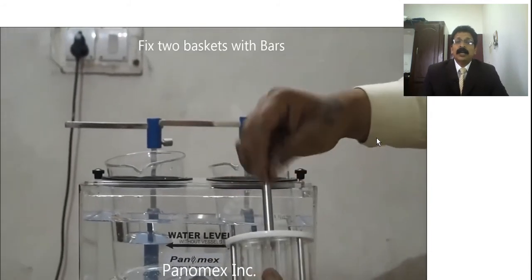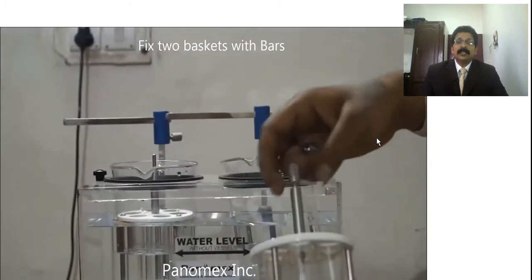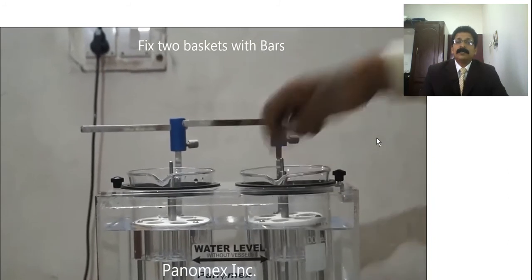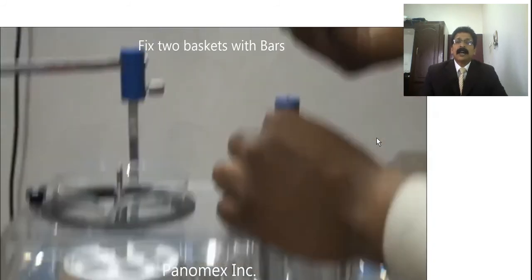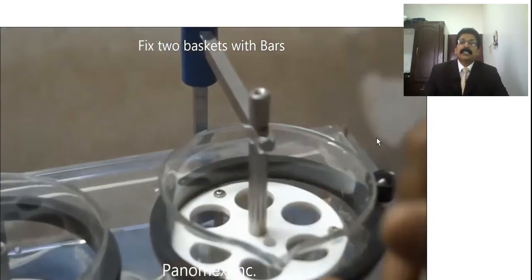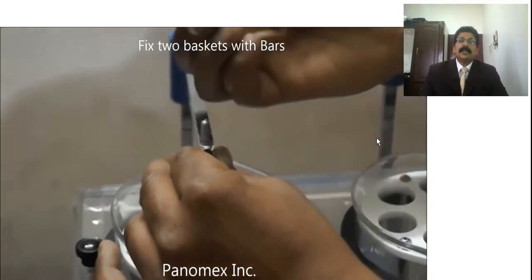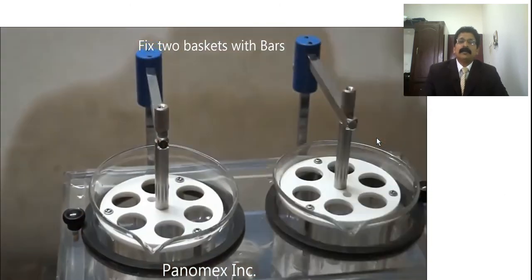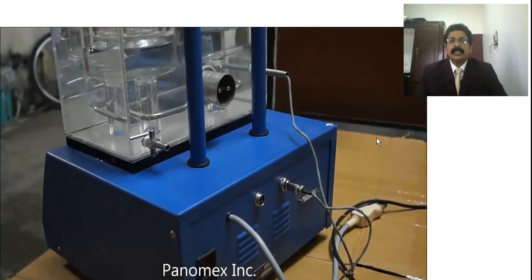Then you take the basket. You see there are 6 long tubes, and the base is with mesh. It is kept inside the 1000 ml beaker which contains the gastric fluid, and then it is connected with the particular shaft coming from the holder, which has the provision for an up and down action. Both of them will be in the same position, and the height will be maintained the same, so that the shaft gives the up and down action which we can see.